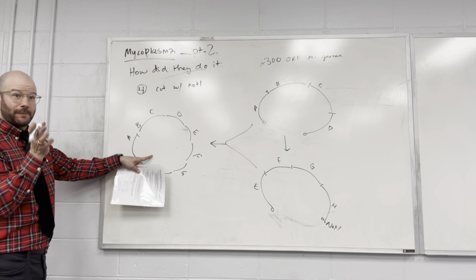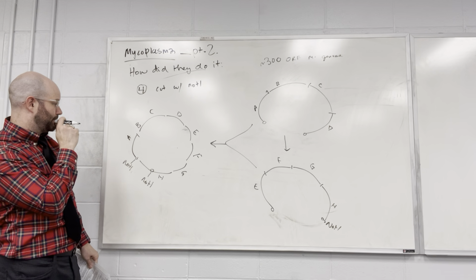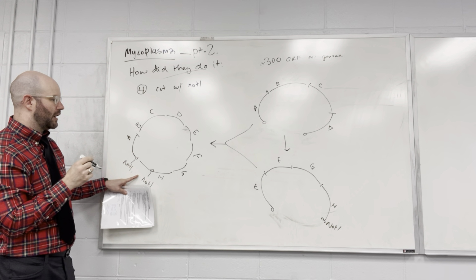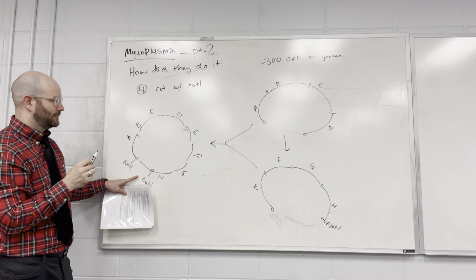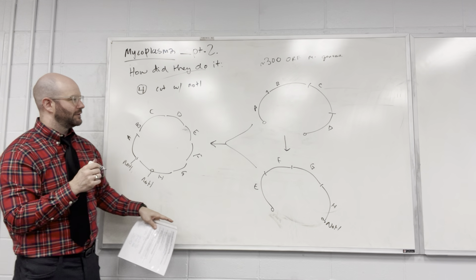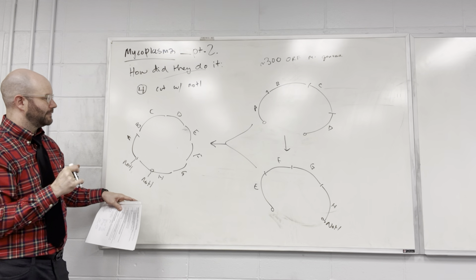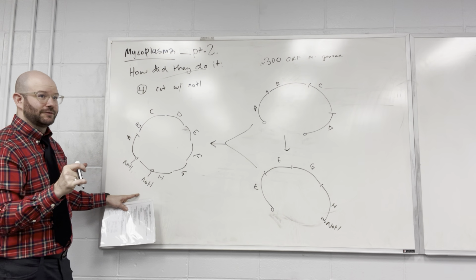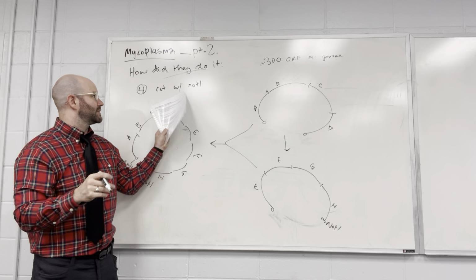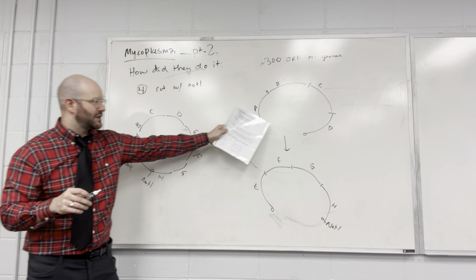And so this was what? Oh, I was going to say they formed it into that plasmid that you drew at first. How did they do that? Well, after they cleaved it with NotI, that's the first part. Then what? It's not anything new. They digest it. Well, they already digested it. You already said that. So if you just digest these, what's missing?